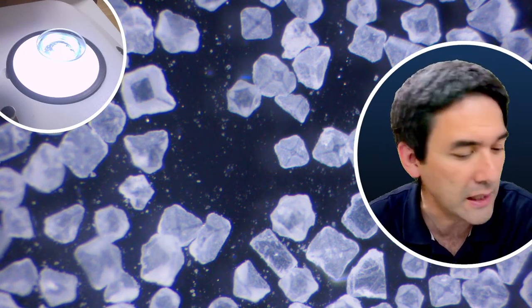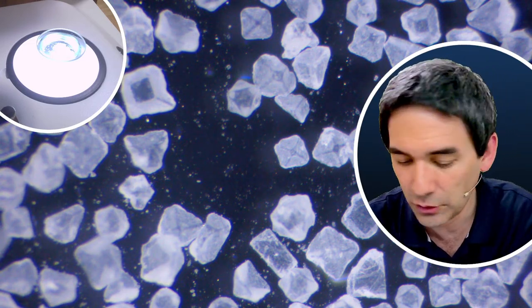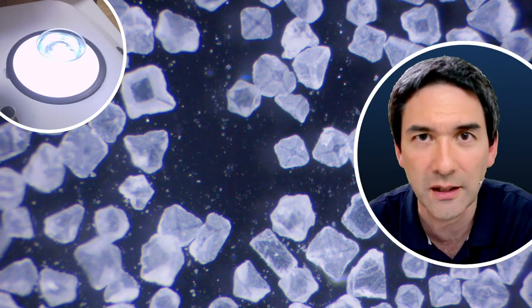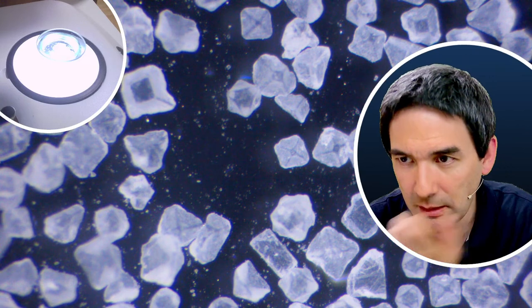Today I want to put a few samples under the microscope, and I would like to also show you how to grow a few crystals under the microscope. So what I'm going to do now is I'm going to go back.